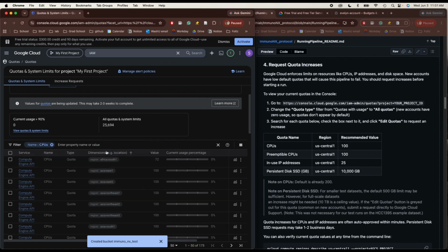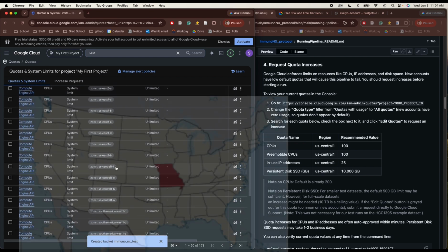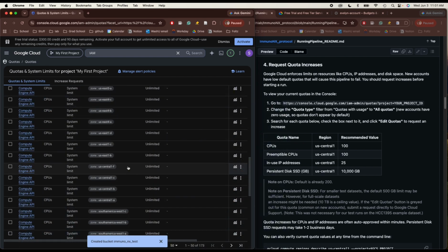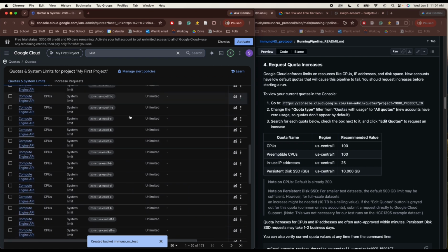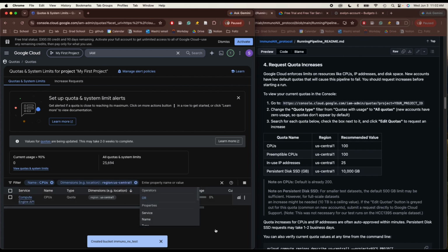And then we specifically want to see it in our location, which should be US Central. Just US Central 1. Okay, yes, and it's already at 200, so that one's good.